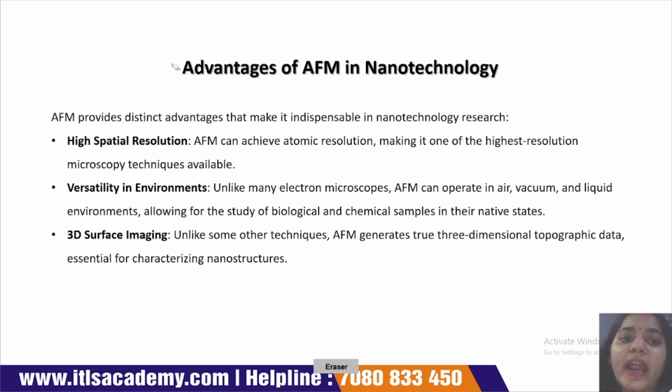Now we study the advantages of AFM in nanobiotechnology. First is the high spatial resolution. AFM provides a high resolution image at a nanoscale. Next is versatility in environment. We can easily operate the AFM in aqueous, air, and vacuum environments, which allows the study of biological and chemical samples in native states.